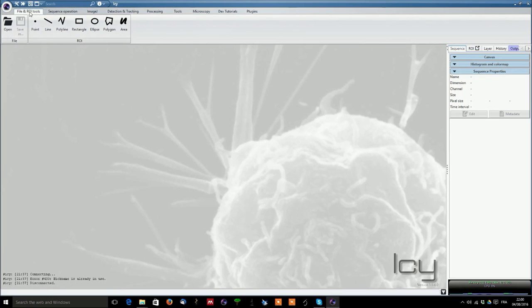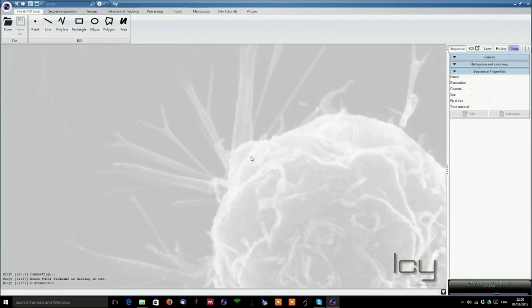First you have the files and regions of interest tools, open and save as, and you can point or use different types of region of interest tools.